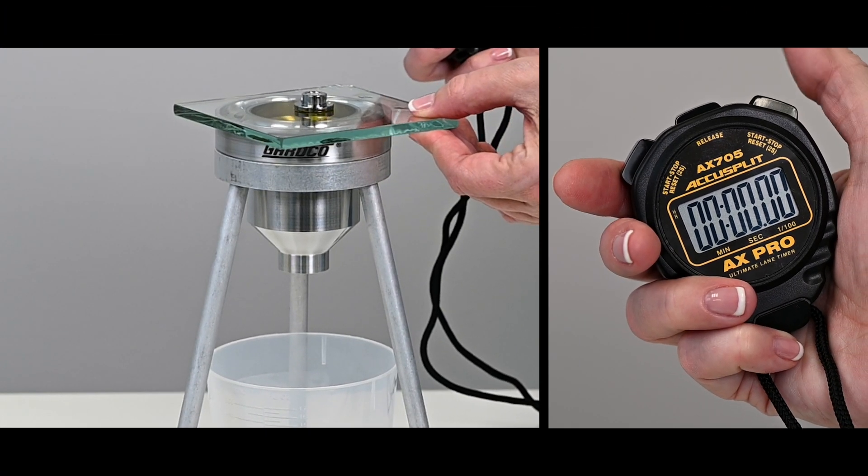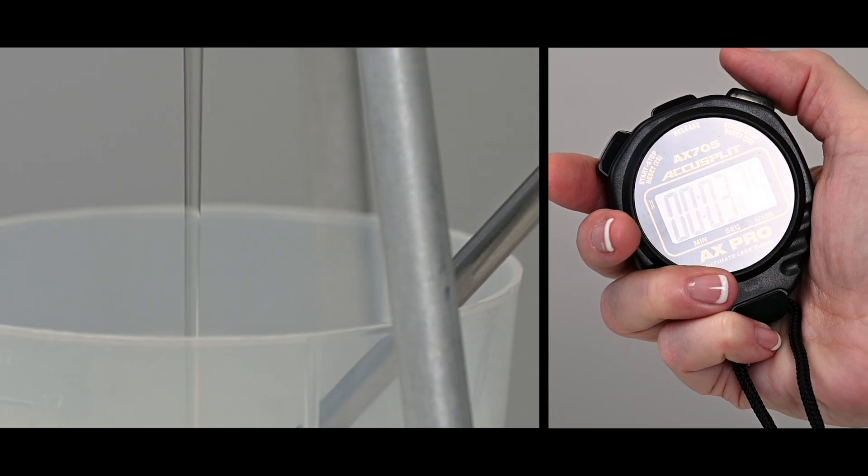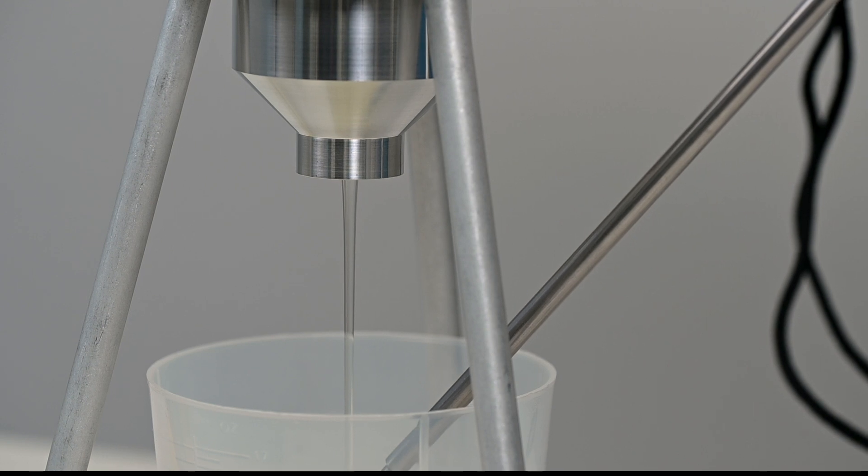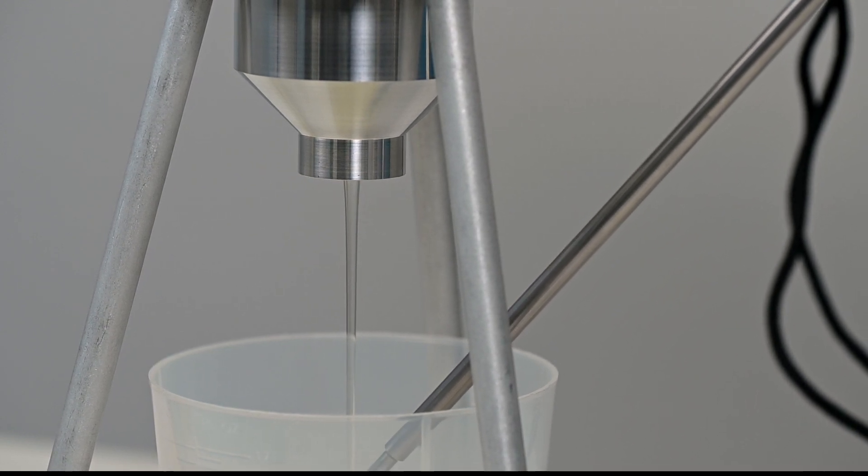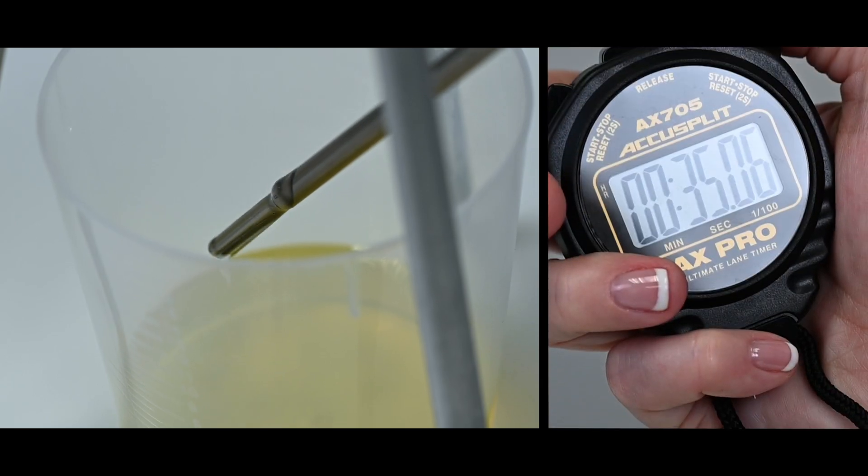Start the stopwatch at the precise time the cover plate is removed and observe the efflux flow and temperature. Allow the efflux stream to fall on the thermometer and observe the temperature. When the first definite break in the material is observed, stop the stopwatch.